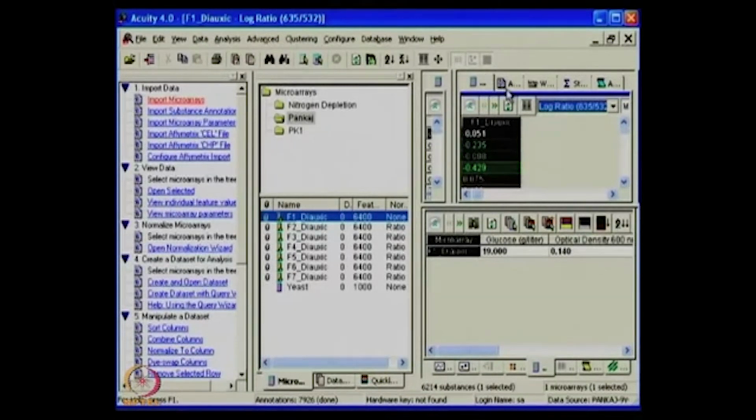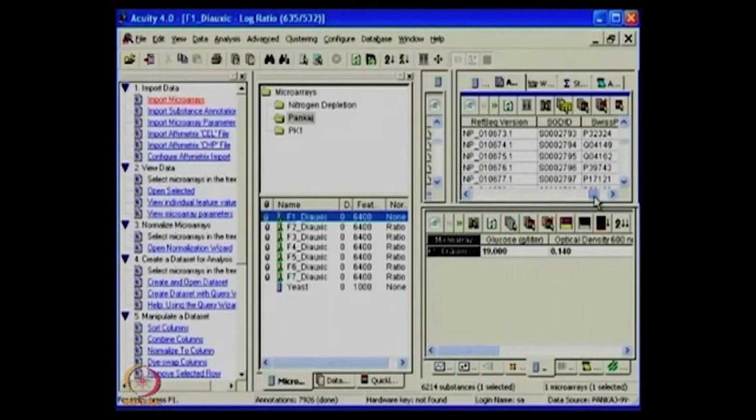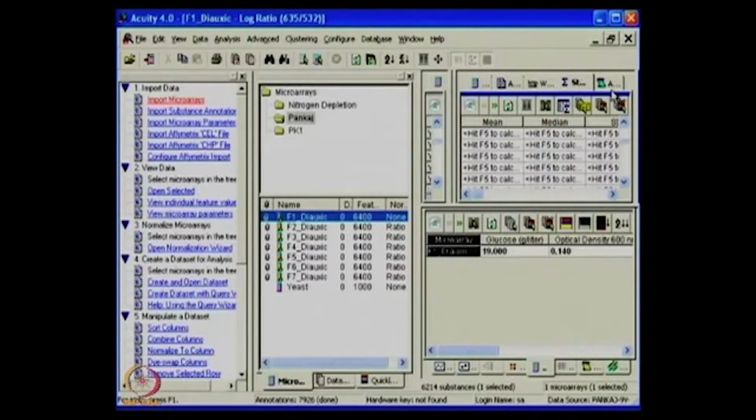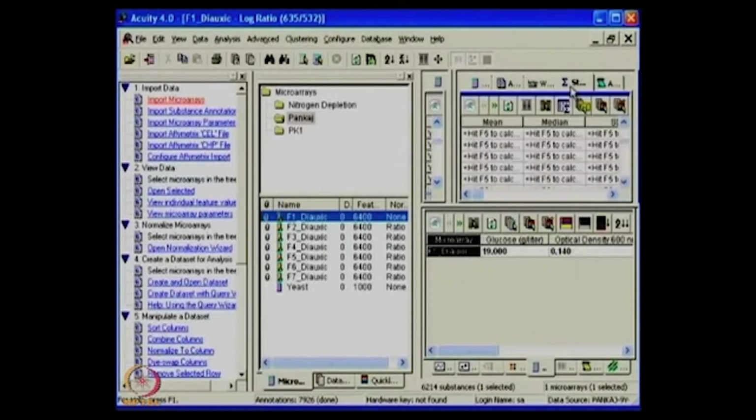Apart from this, the other tab includes the annotation, which gives you what all is being traced at the level of annotation names in the form of different databases, information on the genes or how the protein is behaving or even the localization, where it is being localized, all that can be traced. It also gives a little bit of other details in the form of statistics, warehouses and a few of the auto scripting capabilities which advanced users sometimes want to use. But this particular statistic will allow you to see what all you want to see, which we see in detail. In the bottom, what you essentially see is how the data is looked at.